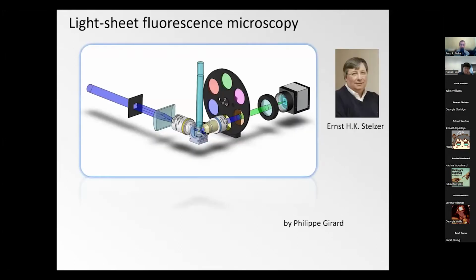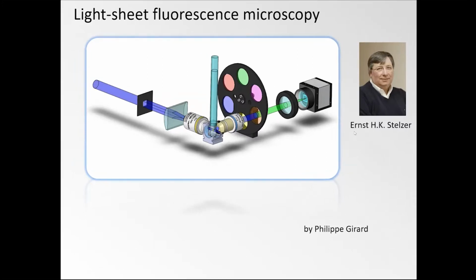All right. So what is a light sheet fluorescence microscope? Here is a 3D model of one. And these types of microscopes were invented by Ernst Stelzer back then at the EMBL in Heidelberg, when he was tasked to make a more practical microscope. He made very stunning microscopes, among them the 4-pi microscope he was involved in. Then I think the idea was to build a microscope that can be really employed in many research fields.